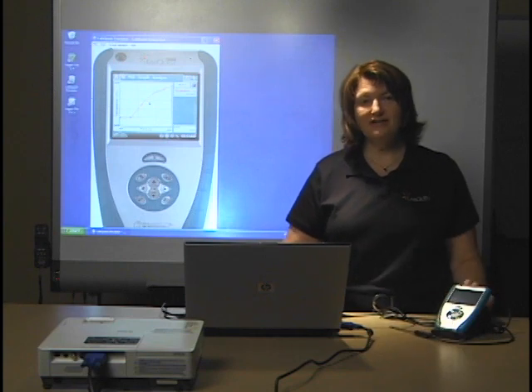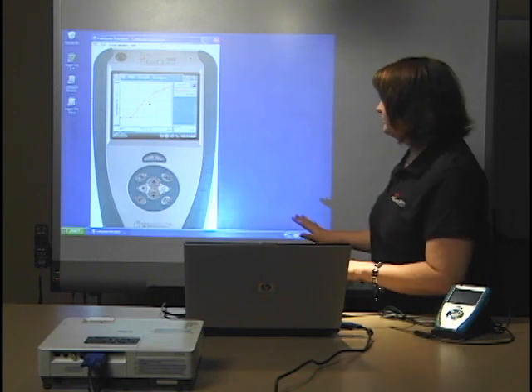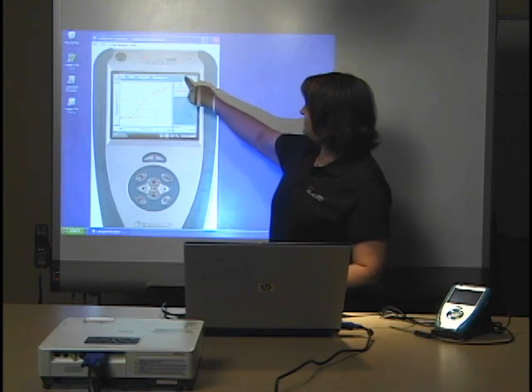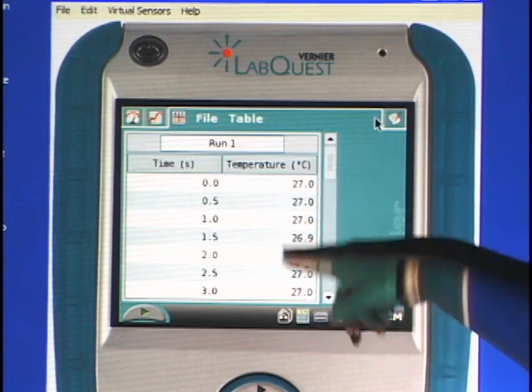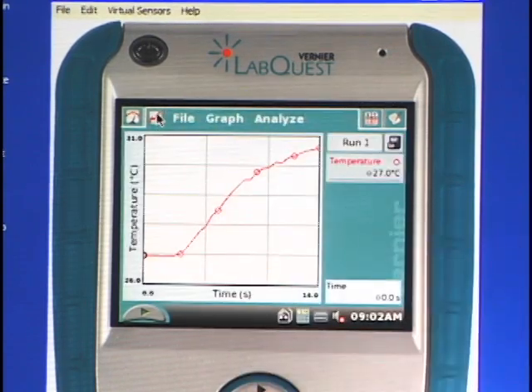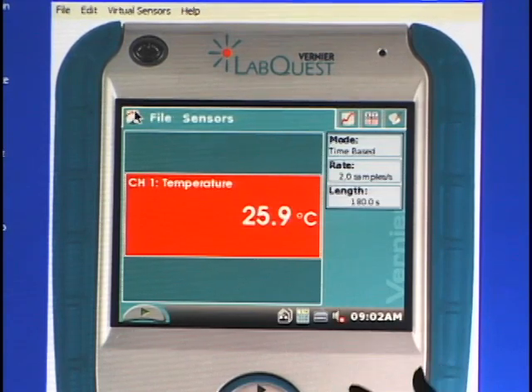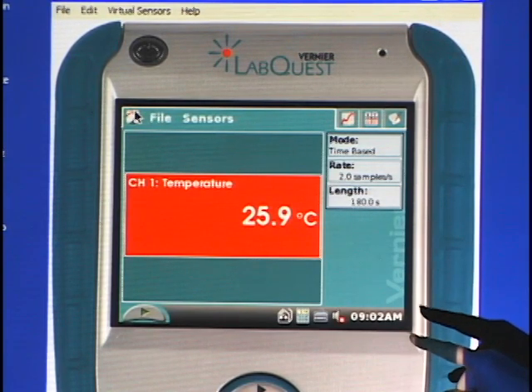If you happen to have an interactive whiteboard, this is really nice because you can go up to the front of the classroom and tap on the board itself. Here, if I tap on the data table, I'm showing the actual data. You can go back to the graph or over to the meter, and you're right there so you can be talking to the students and telling them about what you're doing at the same time.